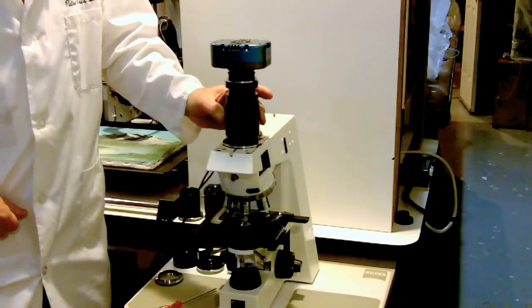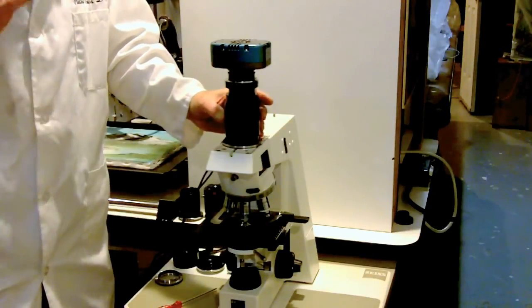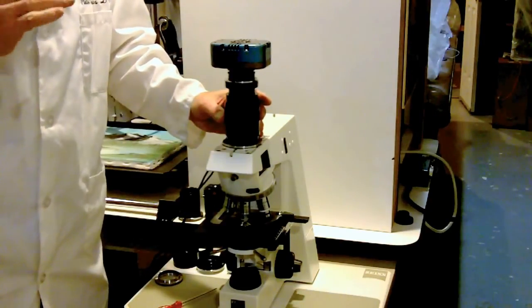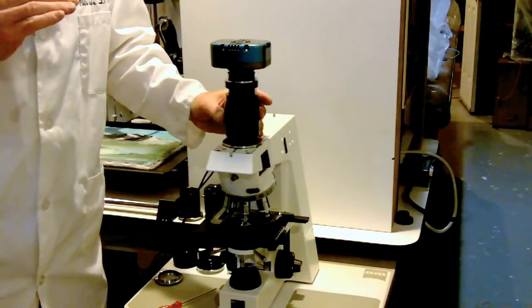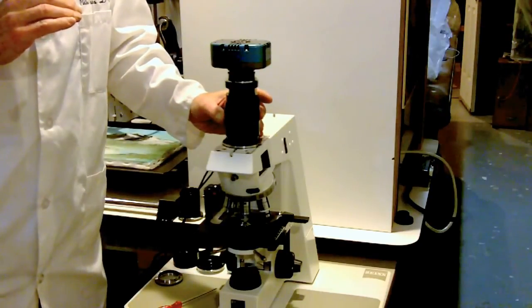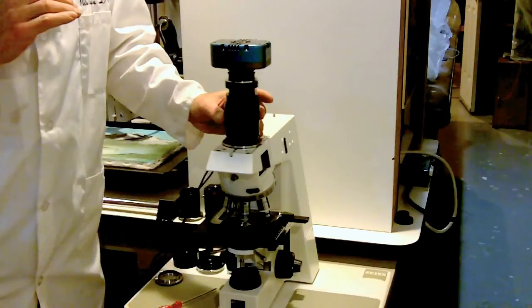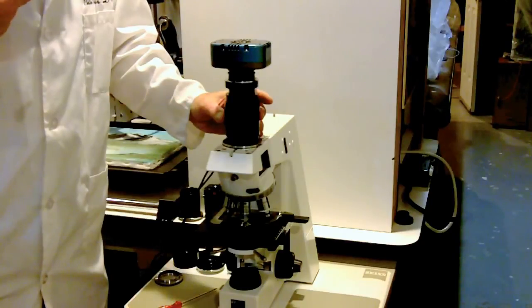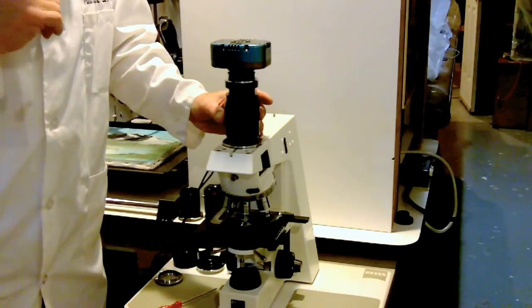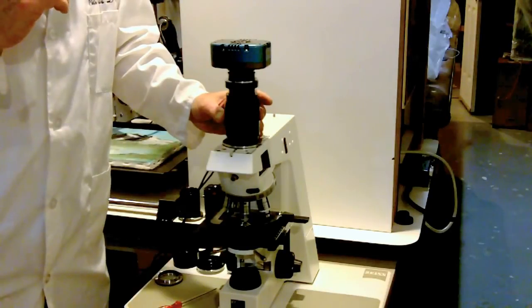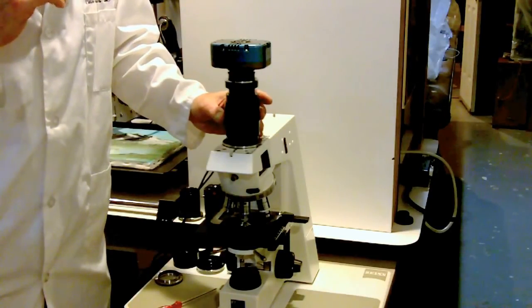There's a reference point on the front here. We turn this ring here, and when we use mid-range dry objectives or even oil immersion objectives that are typically corrected for a number one and a half or 0.17 millimeter thick cover slip, with this ring we can compensate for spheric aberrations that you normally would get if you don't know the thickness of the cover slip or if there's a mounting media below the cover slip that is actually making that interface between your sample focus and the top of the cover slip much thicker than 0.17 which is what the lens was corrected for.